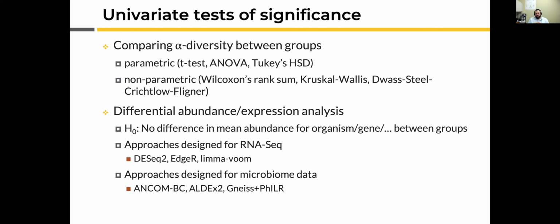Some people use those for microbiome data, but there have been some publications comparing those and finding that DESeq and edgeR are not the best at handling zeros.